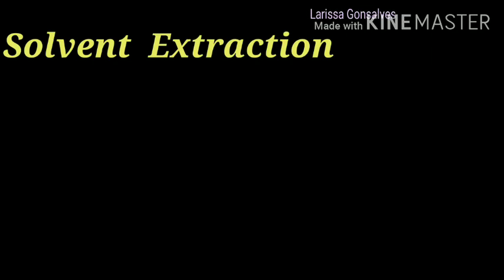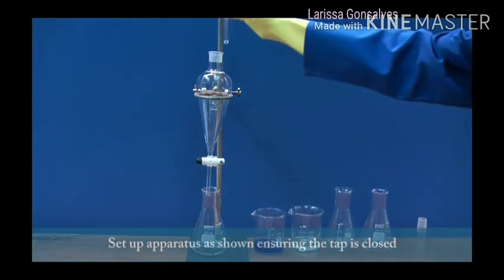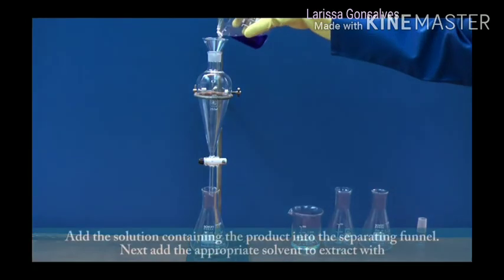Now we move on to the last topic of this chapter, that is solvent extraction. If an aqueous solution contains an organic substance, then it can be separated by mixing the aqueous solution with an organic solvent in which the organic substance is soluble. Let us watch a video to understand the process of solvent extraction. This is the apparatus set up for carrying out the solvent extraction. The funnel here is called the separating funnel.